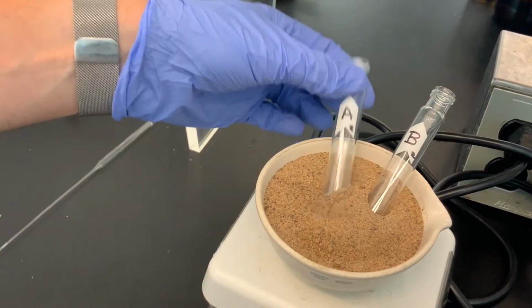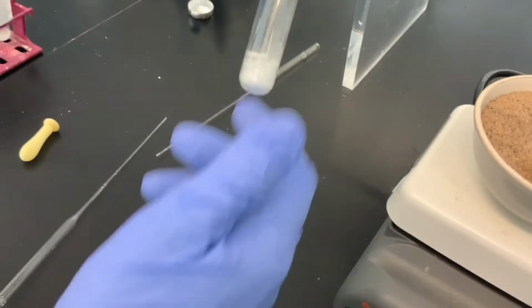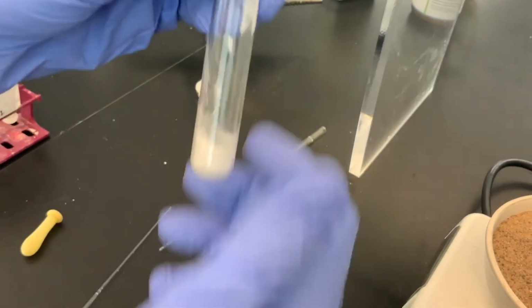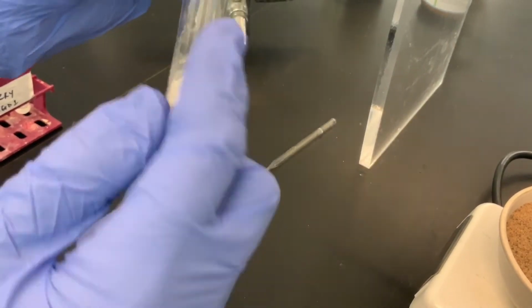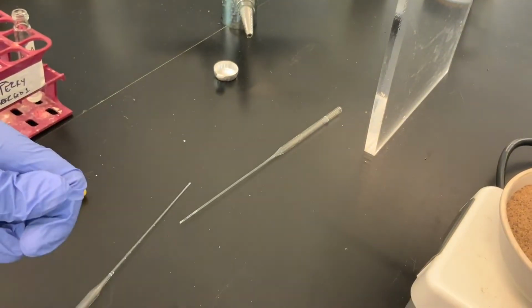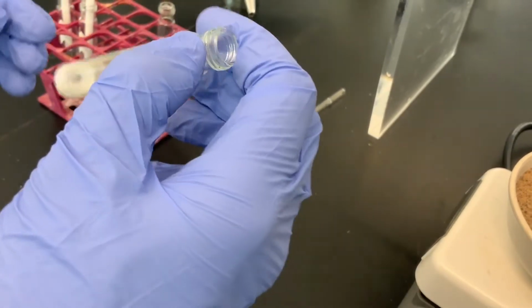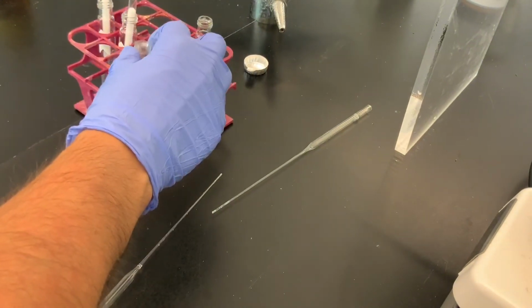Let's see, has part A left? Yes, all of the methylene chloride is gone. There's a little bit of sand on there, but now this is the residue. This is benzoic acid, right? This was what was dissolved in the organic layer the entire time. And so we're going to let this cool before we acquire its mass, because when it's hot, it actually pushes down on things.